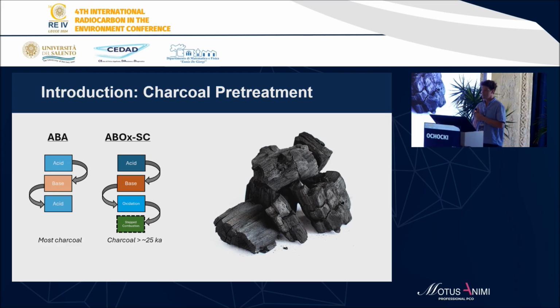It's very porous with a high internal and external surface area, and so is susceptible to contaminants from groundwater table movement or microbial activity. And so for that reason, we typically pre-treat charcoal in Oxford. We use these two methods.